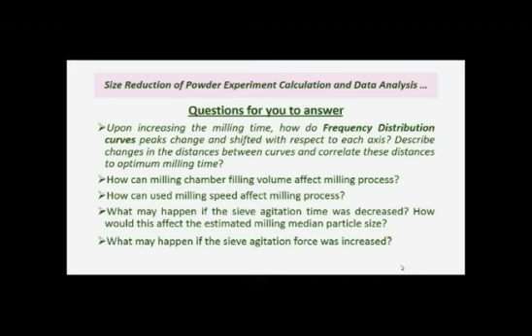This may contribute toward the estimated median particle size being higher than expected, higher or overestimated.